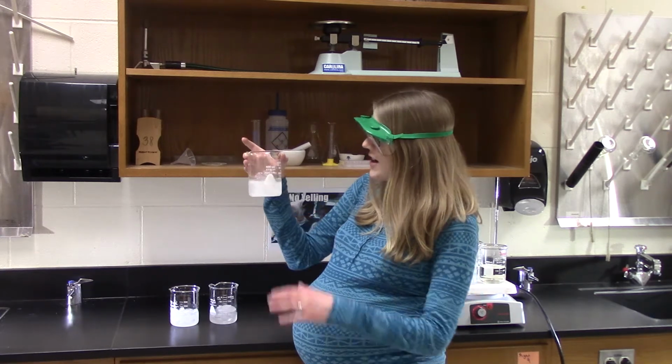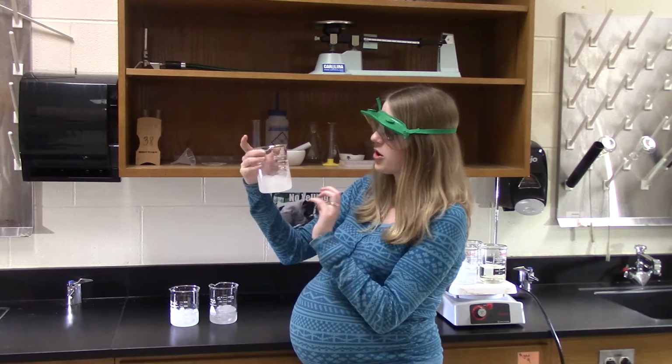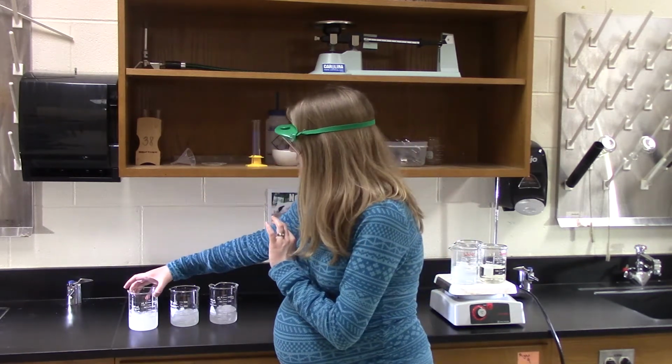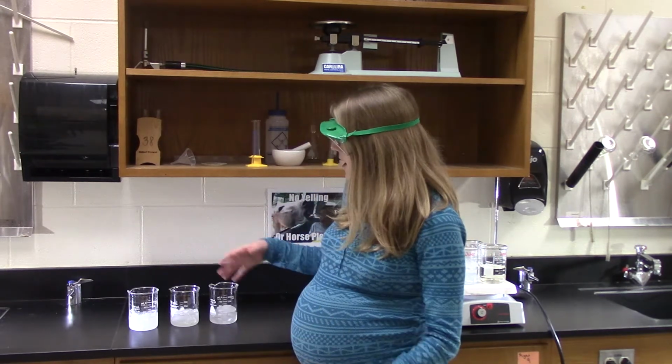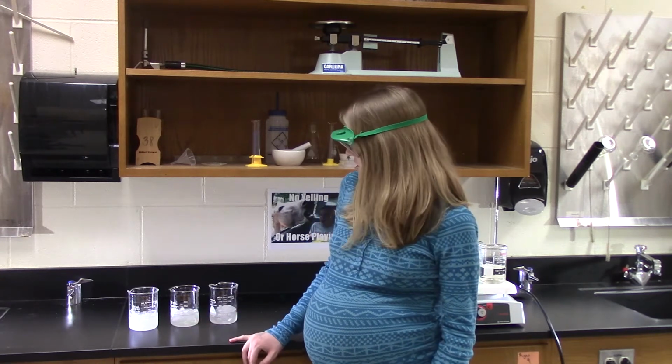Something else that you can kind of see, and you can't see it as well, but usually I actually have frost forming on the outside of the beaker. This time for some reason I'm not. It's probably because it's sitting closer to the hot plate, so it is a little bit warmer right now, but typically I get some frost forming on the outside of the beaker. Why? That water's coming from the air. When it hits the cold beaker, not only does it condense, but it ultimately freezes because the water inside is actually much, much colder than the freezing point, causing the gas, the water vapor, to actually become a solid on the beaker. So I typically see that. We did not get to see that this time.